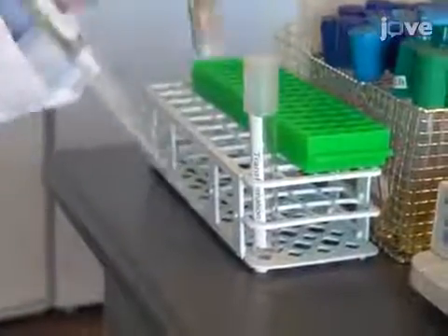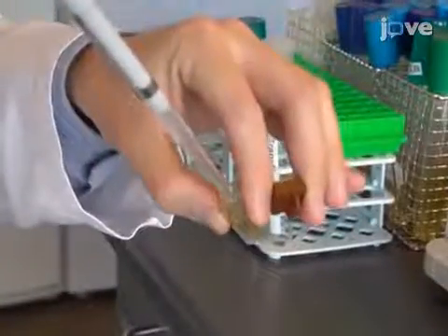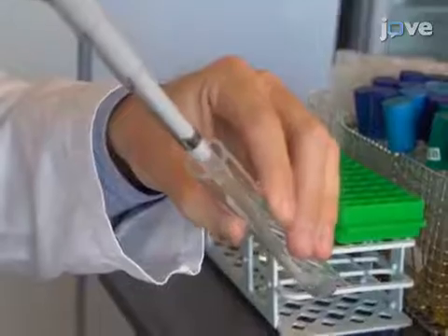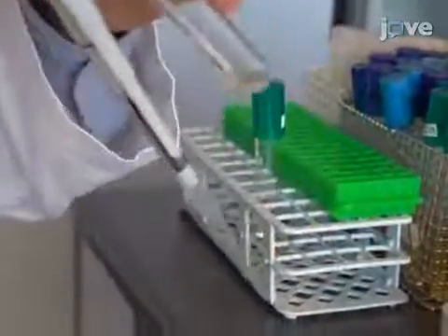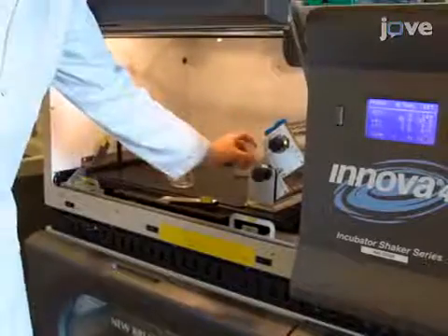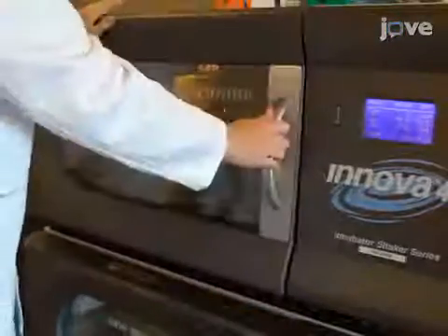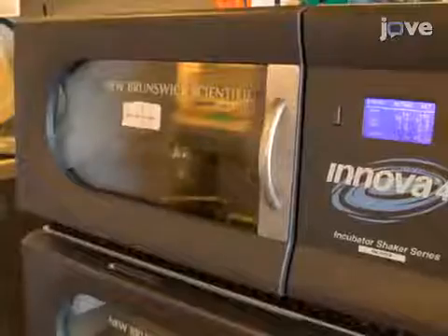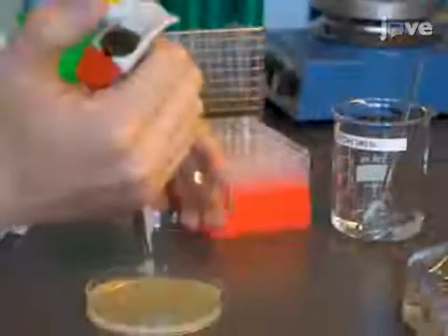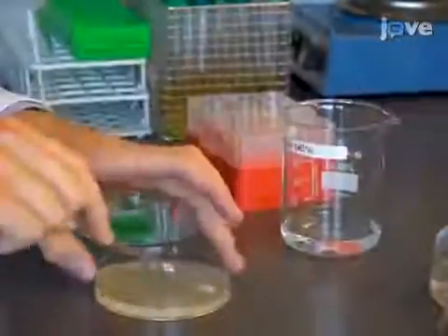Quickly recover the bacterial suspension by resuspending it in 1 milliliter of pre-warmed LB broth, and transfer to a 15 milliliter test tube. Incubate the cells under aerated growth conditions at 37 degrees Celsius for 30 minutes, without antibiotic selection. Then plate the bacteria onto LB agar plates supplemented with 50 micrograms per milliliter of kanamycin, and incubate the plates at 37 degrees Celsius overnight.